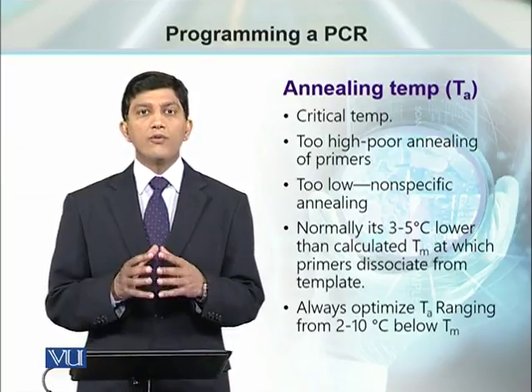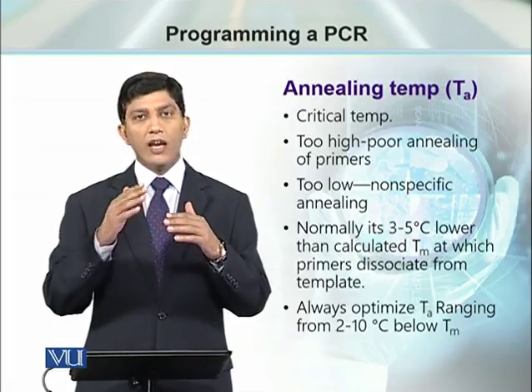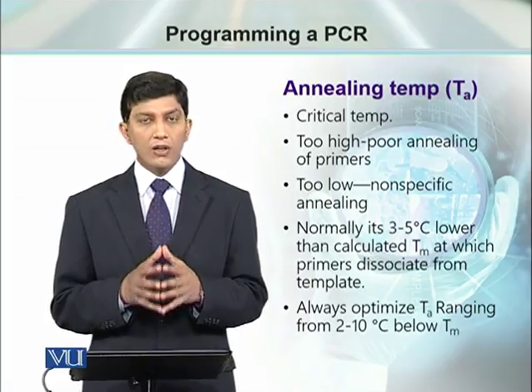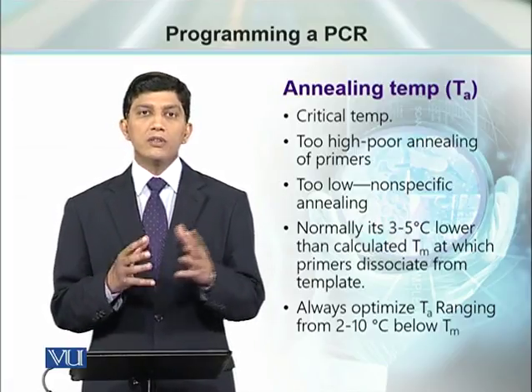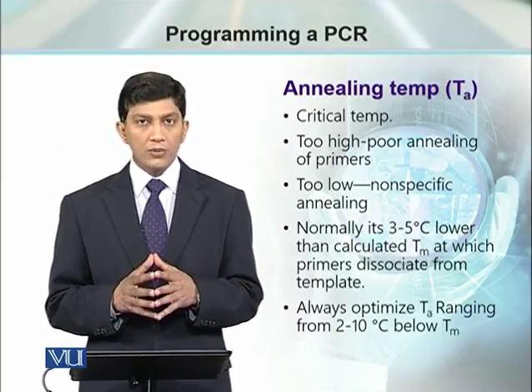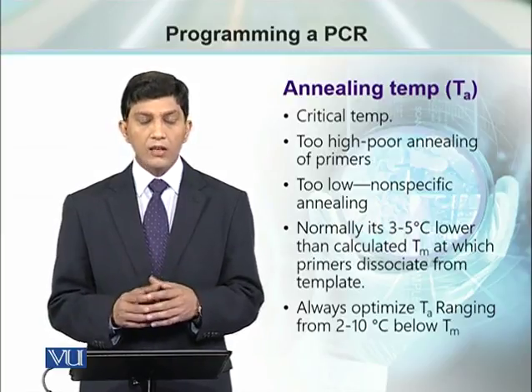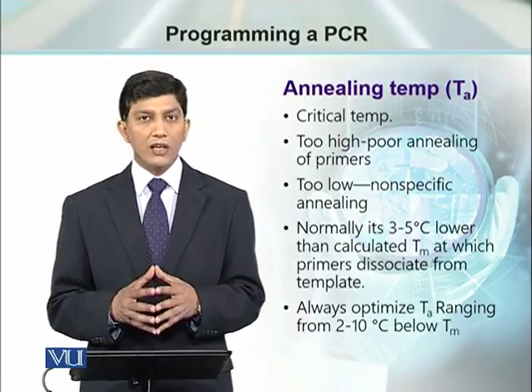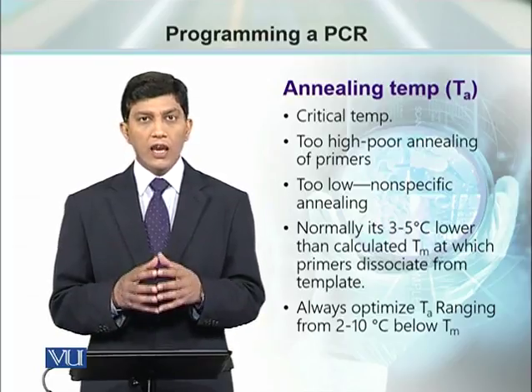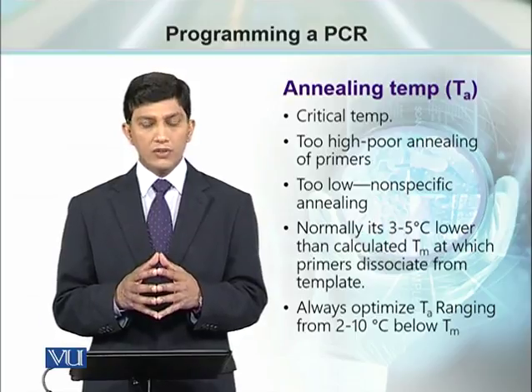After the denaturation, we have to talk about annealing temperature. From 94 degrees centigrade, we have to drop the temperature, and the annealing temperature is critical because that determines if the primers bind to the template strand or not. Too high an annealing temperature means poor annealing of the primers. Too low an annealing temperature means non-specific annealing: the primer will bind to non-specific sequences and will try to amplify those areas which are not our areas of interest.